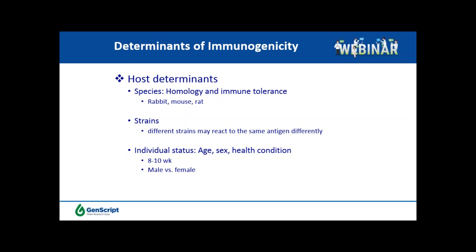On the other hand, other than the antigen, host animals also contribute to a sound antigen strategy. As previously discussed, the first factor to consider when determining your antigen strategy is to choose the appropriate host animal. Choosing the right species of host animals will ensure a low level of homology and put you in the direction of a successful immunization. Once the host animal is decided upon, it is important to identify the appropriate strain, as different strains may respond differently to the same antigen.